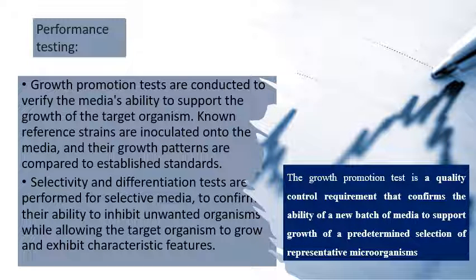So the efficacy of selective media is rigorously assessed through selectivity and differentiation tests, which ensures their capacity to suppress contaminants, that is unwanted organisms, while promoting the growth and expression of specific characteristic features in the target organism.